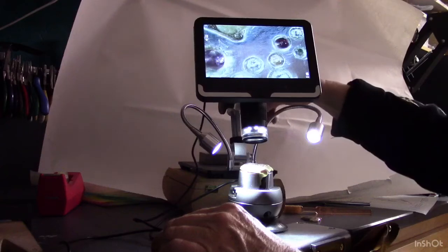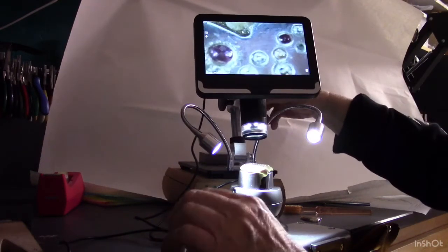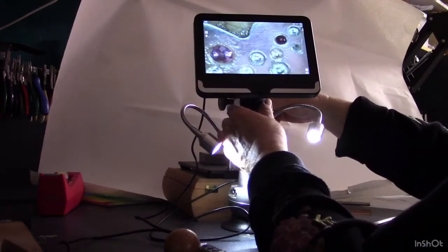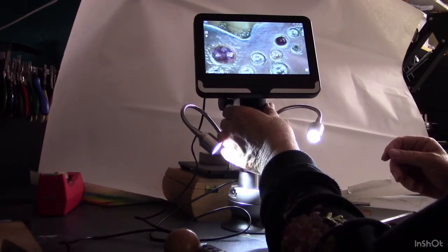And the whole thing moves up and down like this. And then you can adjust your focus.